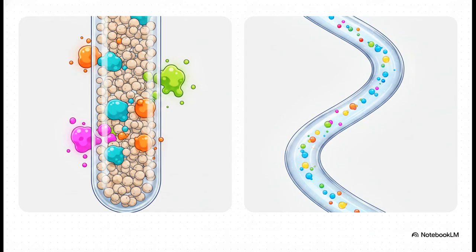These are ultra-narrow, hollow, open tubes made of fused silica. And get this, they can be up to 60 meters long. Since the stationary phase is just a microscopic film on the inner wall and the path is wide open, it gives us incredibly sharp, high-resolution separations. It's the only way to untangle those 208 distinct pesticides.